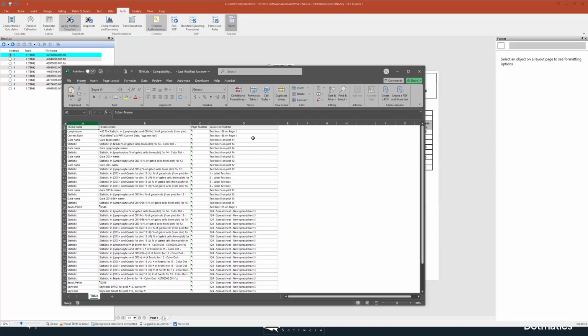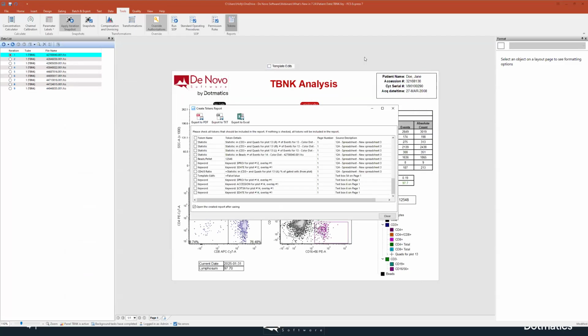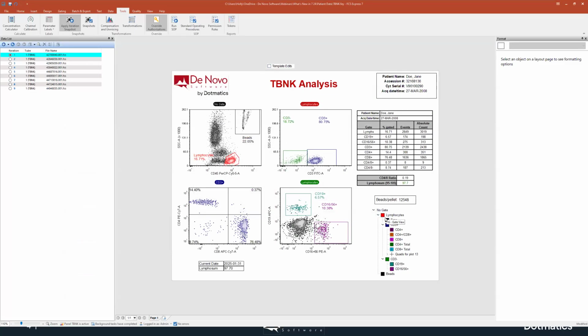only because it gives you an Excel here, and you could add extra columns where somebody comes in and signs off on it or puts a little checkbox or initials it or whatever you want to put together for your validation. So I think this is really cool. I think it could be really helpful and save folks a lot of time. Okay, so we'll close this.